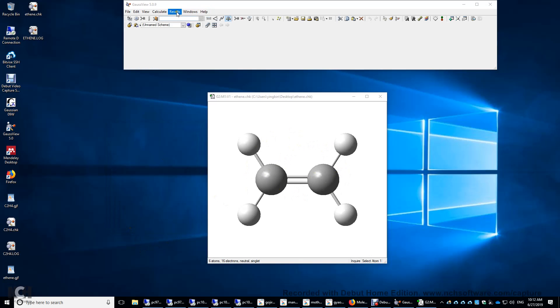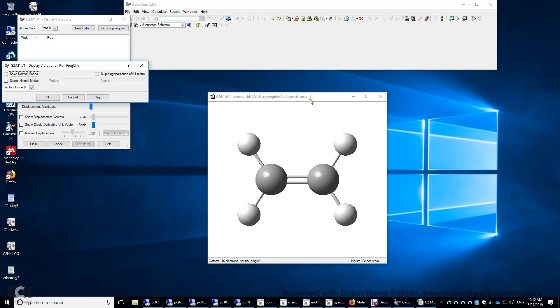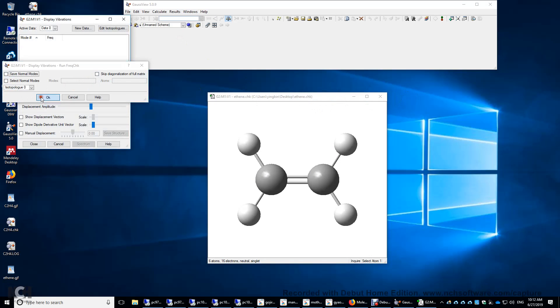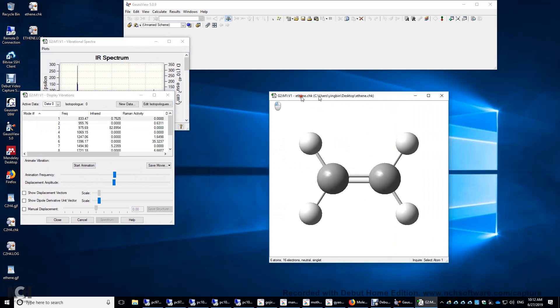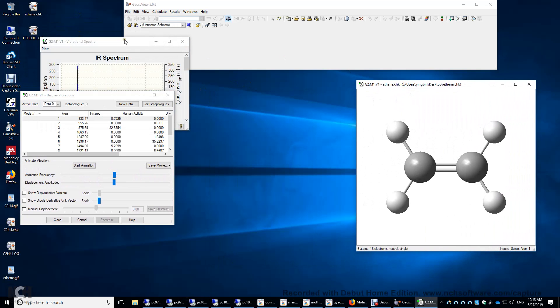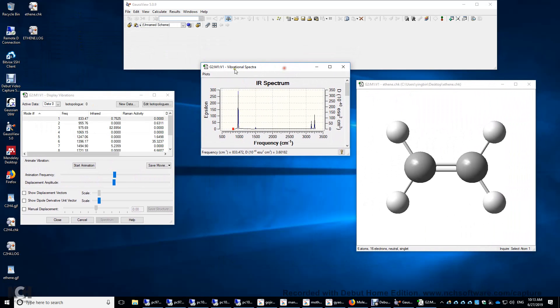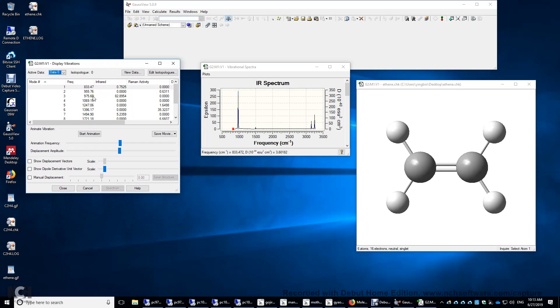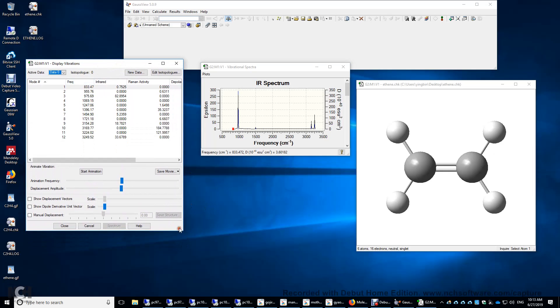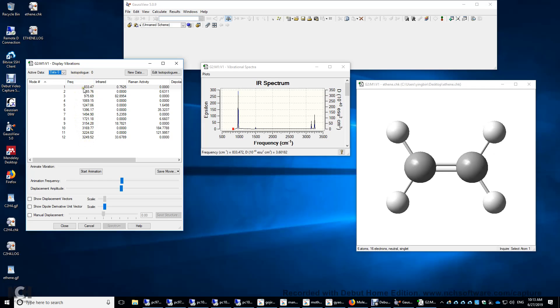And then let's click Results and Vibrations. Click OK here. And you will see all those numbers in this window. There are six atoms. Therefore, there are 18 motions, 18 minus three translation, minus three rotation. You have 12 vibrational modes. And these are not really frequencies. Those are wave numbers in the unit of reciprocal centimeters.